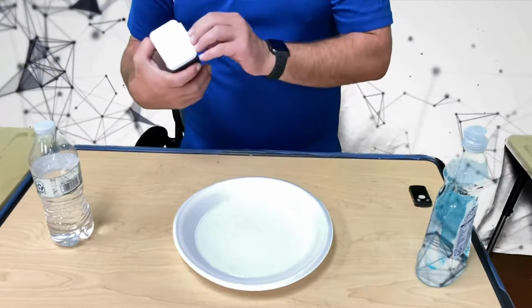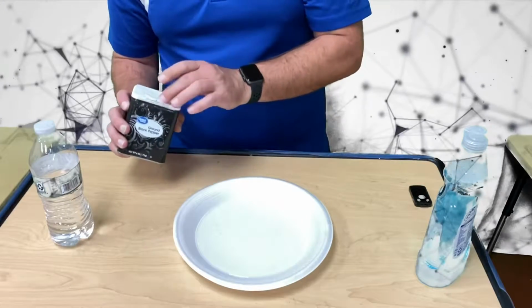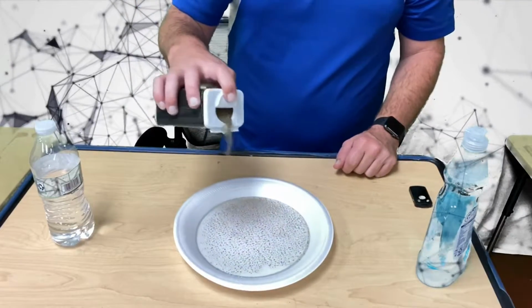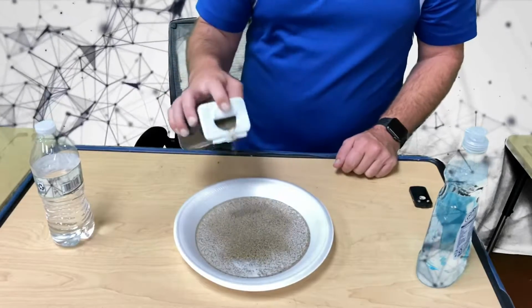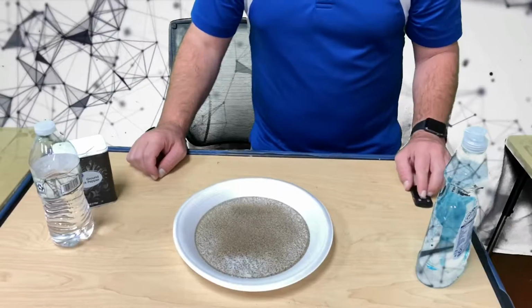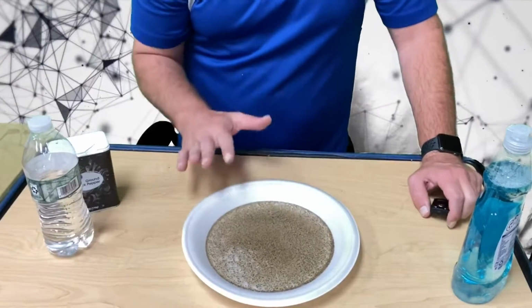I gotta go ahead and open this packet. You sprinkle it on the top of your water, okay?